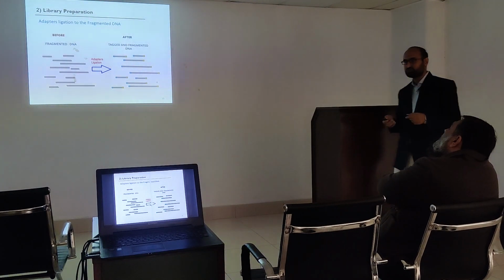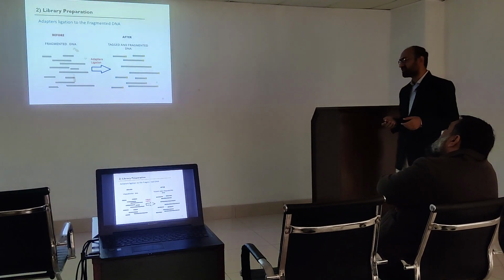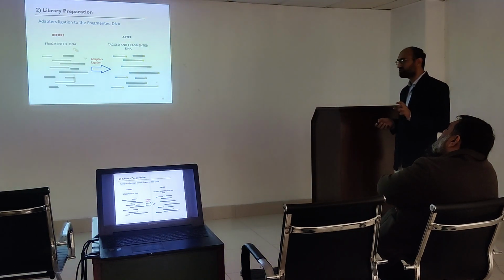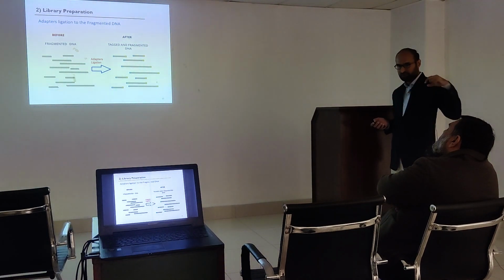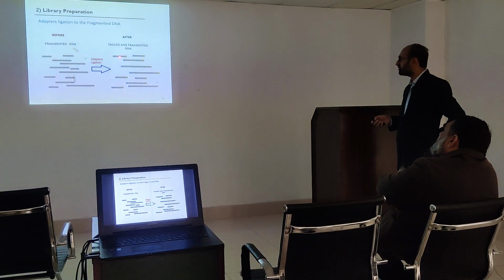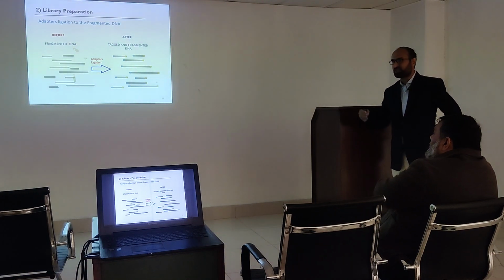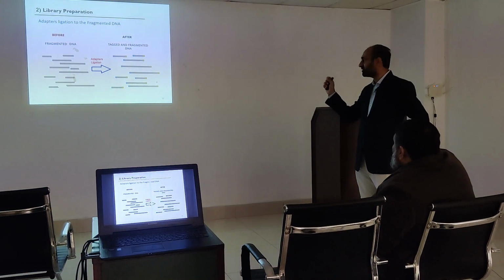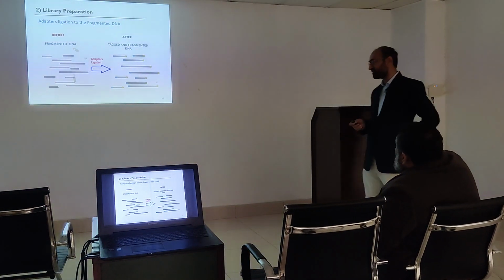So scientists use the ligase enzyme. There are specific double-stranded oligos which are ligated to the ends of these fragments. The sequence of these oligos is known to us. This step is called adapter ligation. These oligos are termed adapters in the technology of next generation sequencing.